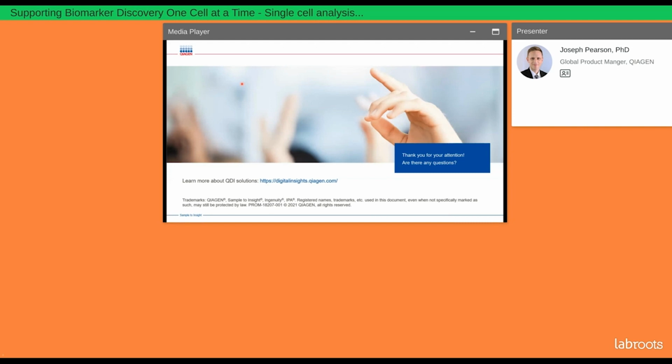Okay, and so kind of the follow-up to that was, do you offer any kind of single-cell analysis pipeline if one wanted to compare their data? Yes, QIAGEN Digital Insights has multiple single-cell pipelines. You can use the QIAGEN Digital Insights platforms and algorithms, or the services team can wrap your custom pipeline into pipeline scripts that can be run directly through OmicSoft.